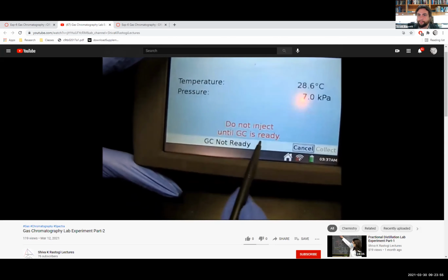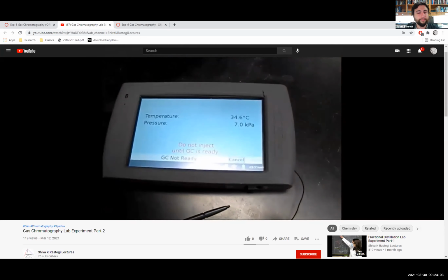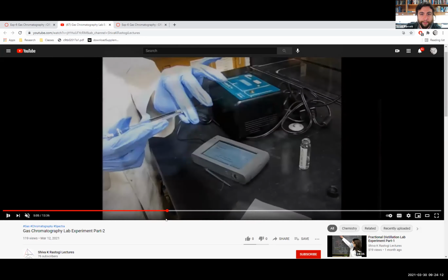So the GC is heating up, the pressure is stabilizing. And you can see on the machine as well, GC not ready. Okay, and then let me see what's next. So here's a little bit of waiting, so we're going to skip ahead and go to the part right here.